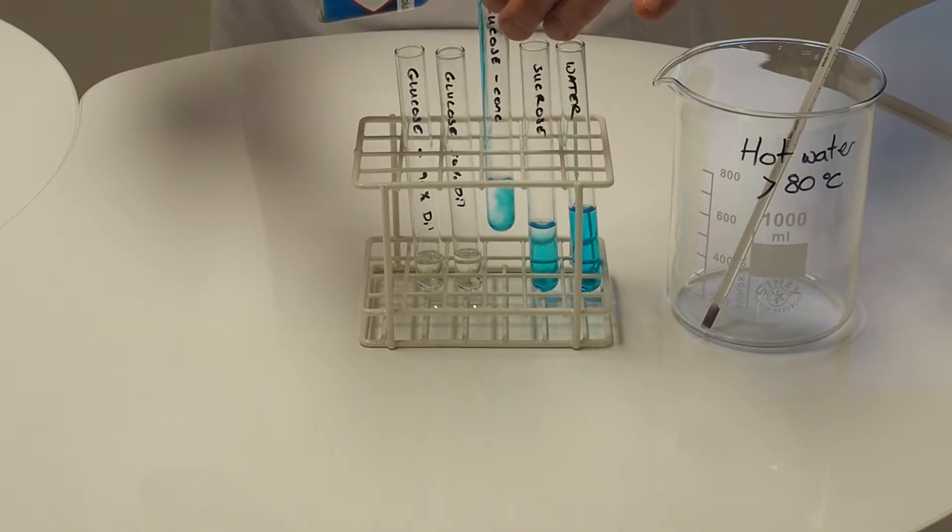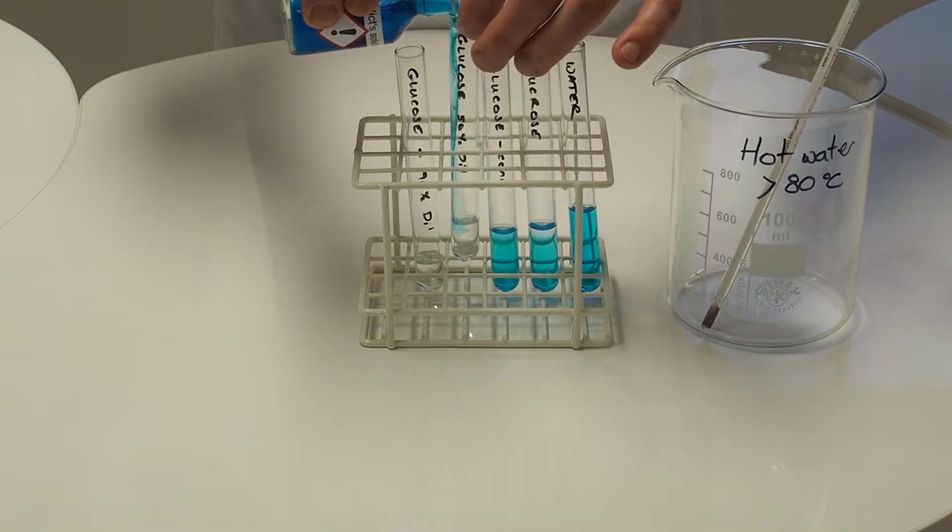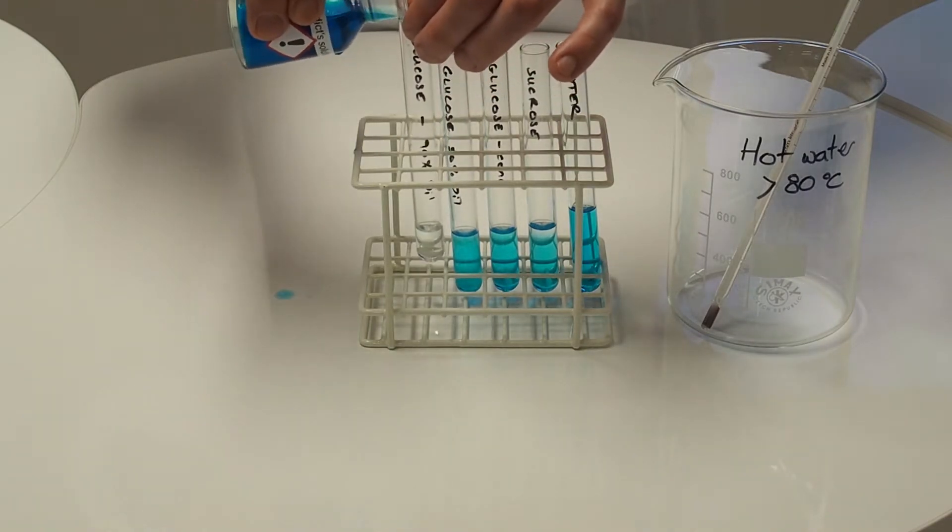This is full-strength glucose. This one's been diluted about 50-50, and this one's been diluted about 10 times.